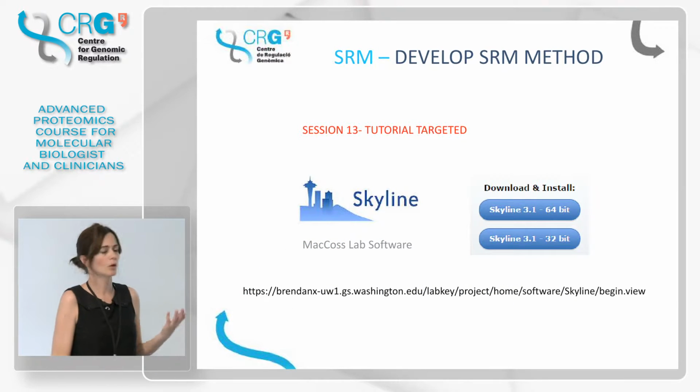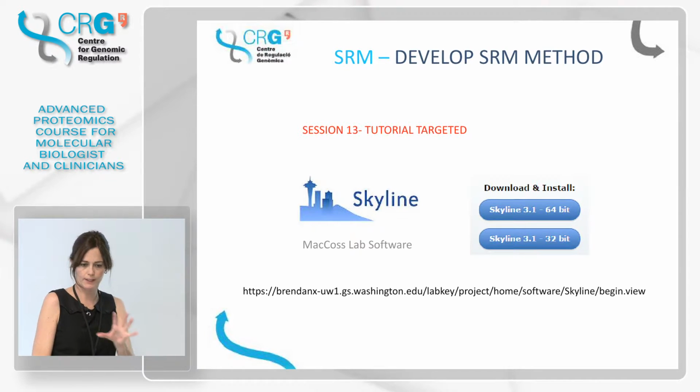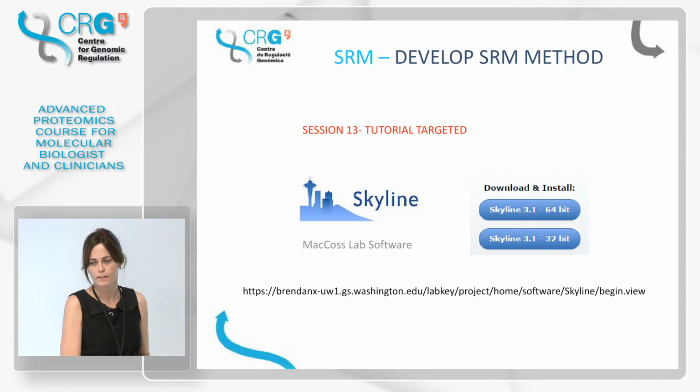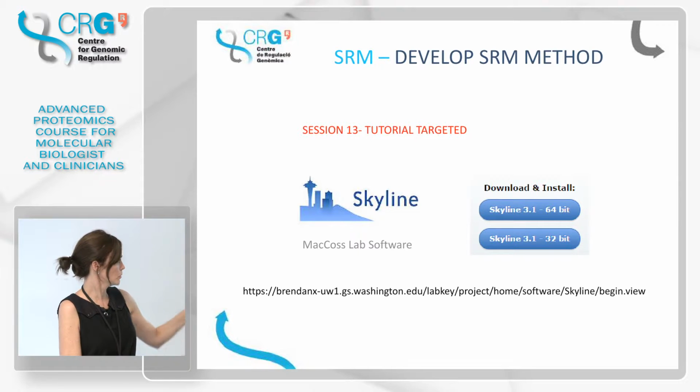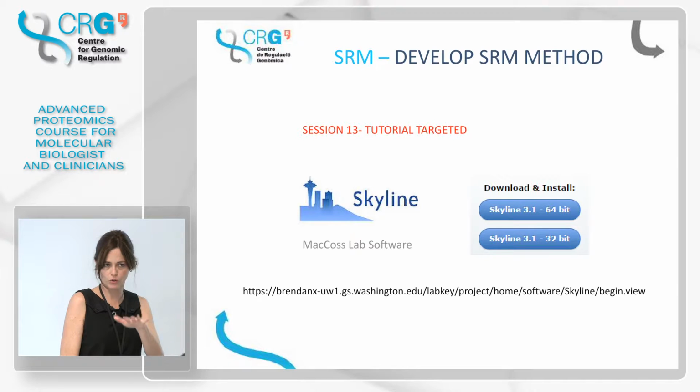So you will be doing this. You will be choosing your transitions in the example that we are going to work with in the tutorial this afternoon, using this software from the MacCoss lab called Skyline. It's open source software that you can download and also use when you go home. You download it, you install it. We will use this software, or one could use another one, to work with this data. So you are going to make your own method, choose these transitions, and also evaluate one result coming from SRM in this same software.